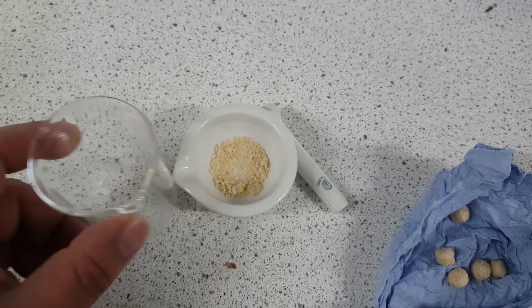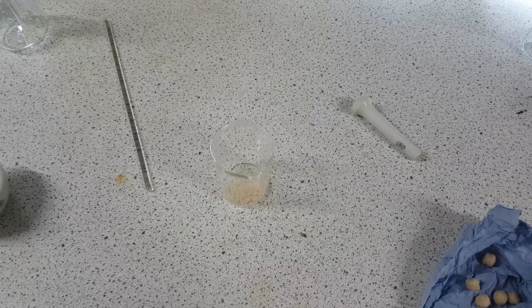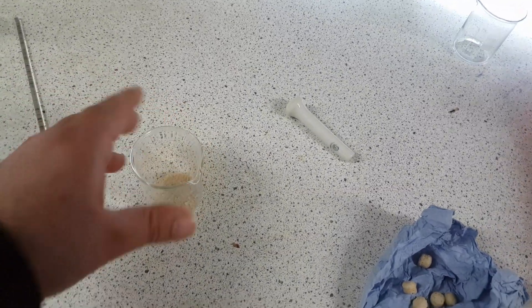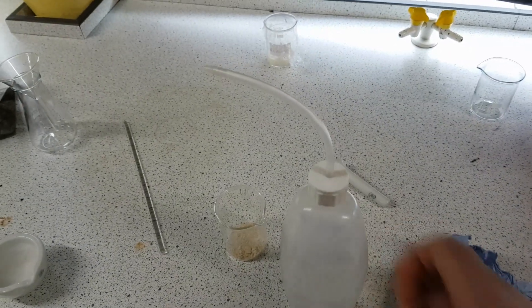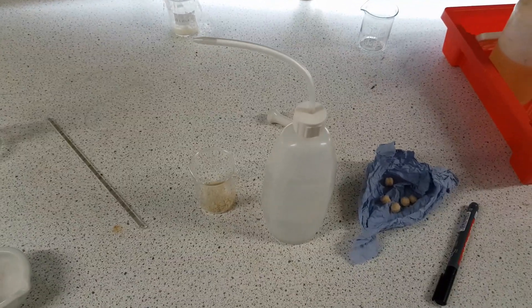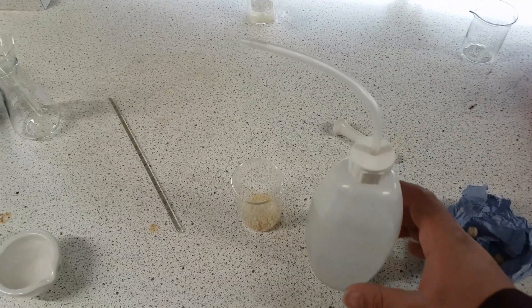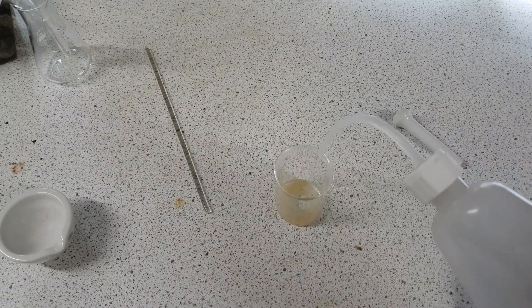Then what I'm going to do quite simply is I'm going to transfer it into a small beaker. So that's been transferred into the small beaker. What I'm going to do is I'm going to add water. The water I'm going to use is deionized water, which is basically pure water — it has H2O and nothing else in it, so there's nothing else that could affect the experiment.